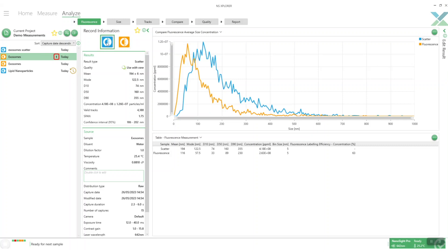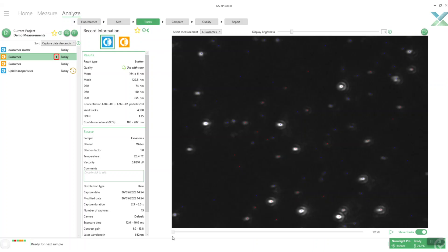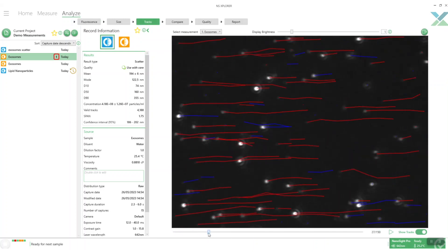We can then also look at the tracks for these videos so for example here we've got the scatter tracks for the exosomes and we can play through them and have a look at what they look like.